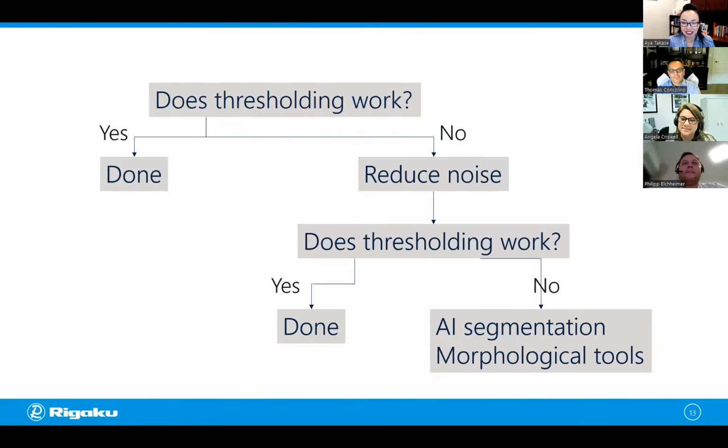I'm going to end the poll and show the results. So they're all somewhere around 15-25%, but maybe a watershed transform is the winner. Well, it's in the lead, but it's not the correct choice. So watershed is something that you might do once you've segmented everything into separate blobs.